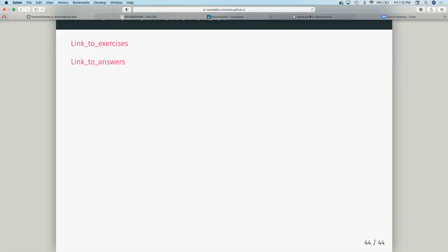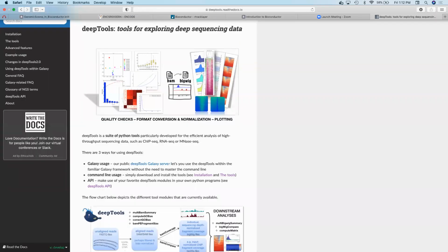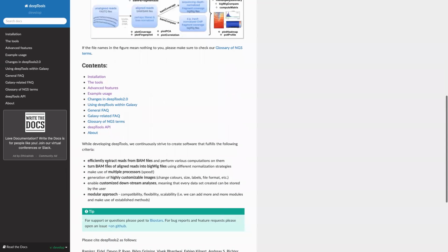Maybe before we go, I just want to give some slightly out of scope advice. If you are interested in bigwigs, we can talk a little bit outside of R for a sec, because I want to be kind of practical. Another really good tool for working with bigwigs is deepTools. What's really great about this is the guy who wrote deepTools, or one of the authors, actually writes some of the internals for bigwig import. It's a guy called Devon Ryan. What's really useful about that is that they are kind of comparable. You can use similar tricks in both.